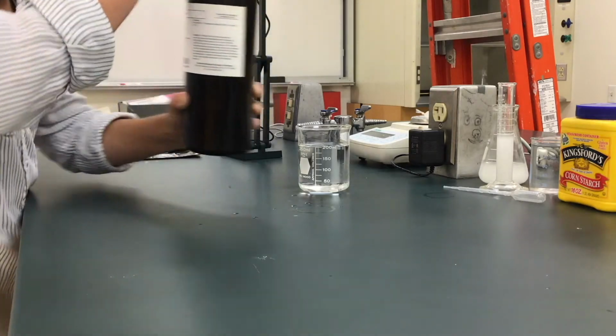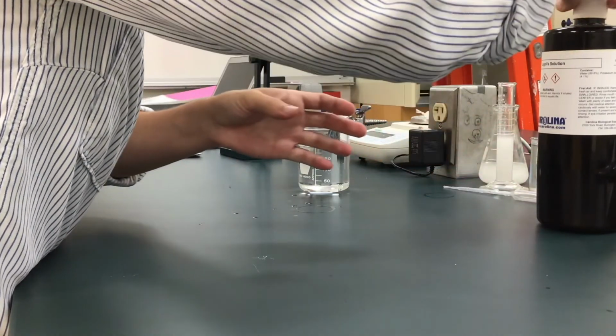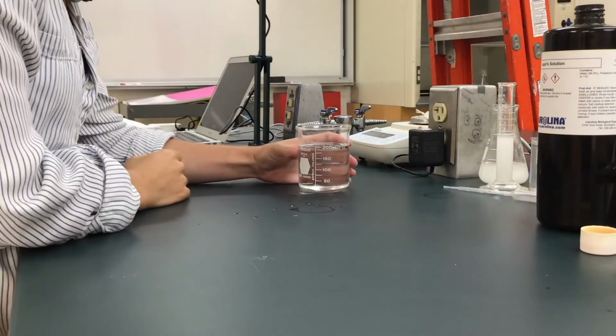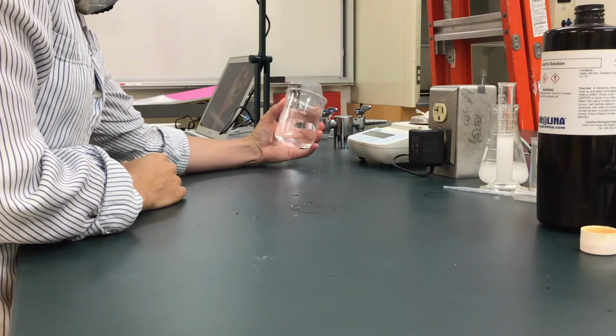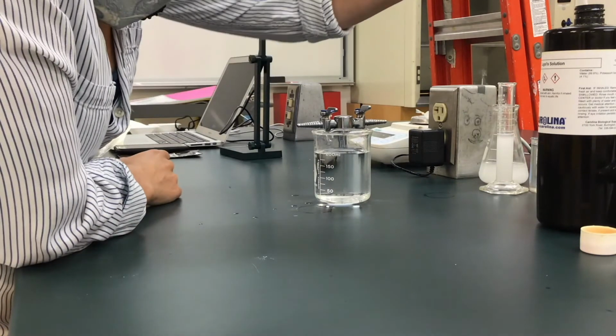But I'm going to use a very, very small volume, just a drop or two, and I'm going to put that into our 250 milliliter beaker of distilled water, and you'll see what color it is once we do that.